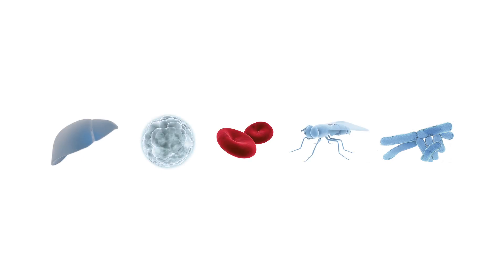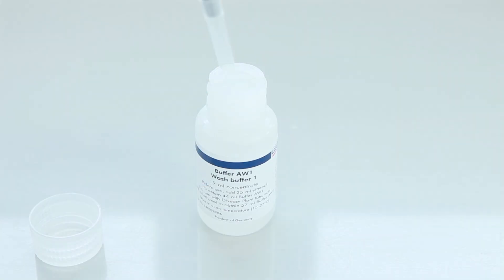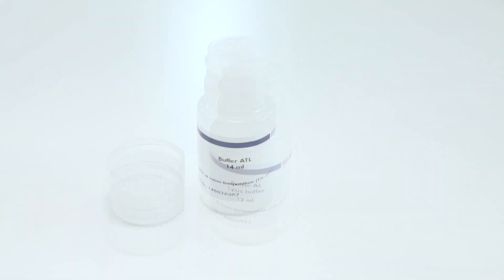No phenol or chloroform extraction or alcohol precipitation is required. Inside the box, you'll find buffer AW1 and AW2, which are supplied as concentrates. Before using these for the first time, add the recommended amount of ethanol into the bottles. Next, check the buffer AL and ATL bottles for precipitates. If present, re-dissolve these.